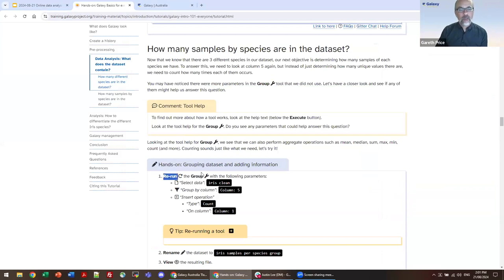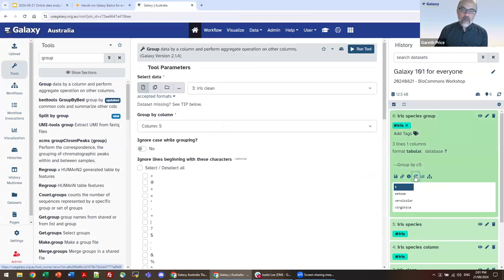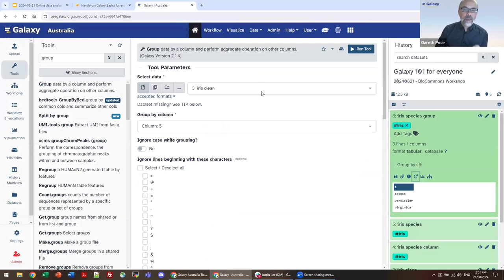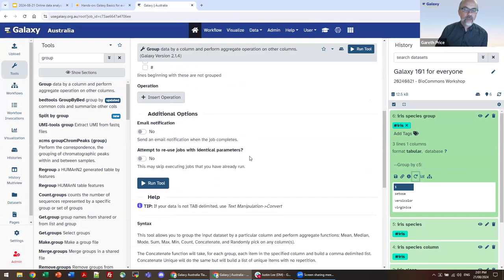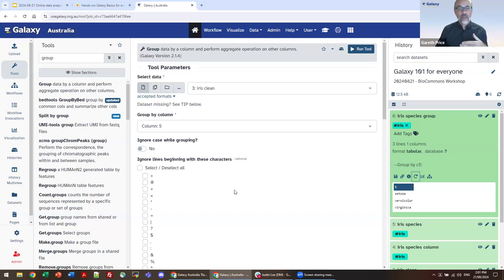The next button I want to talk about is Run Job Again — the rerun icon. This is one that's hard to overstate how valuable it is. It implies you're going to run the tool again, but what it's actually doing is pulling out every specific variable you've inputted into the tool form and populating it again. On something complex like differential gene expression where you're setting up groups, replicates, and p-values for significance, and you might want to iteratively work through group comparisons A versus B, A versus C, B versus C — rerun is absolutely awesome because everything will be the same and you only need to change the one thing.